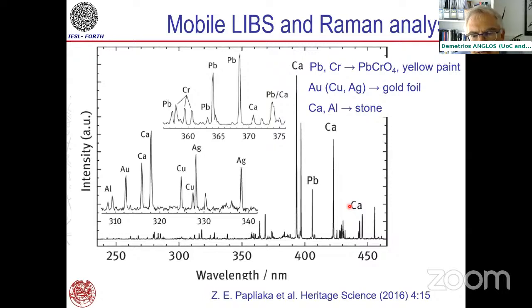Of course, in parallel with this, one can have information coming from the Raman system, so we can combine analytical information towards making a more complete analysis. This is calling for combination of techniques, combination of probes, and sometimes incorporating these different modes in a single instrument is convenient.